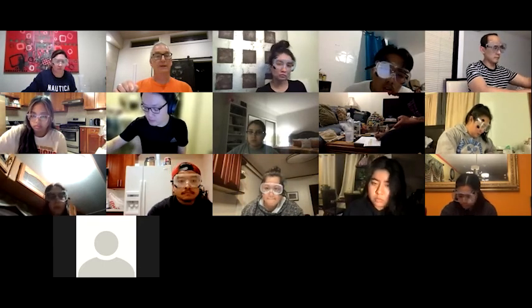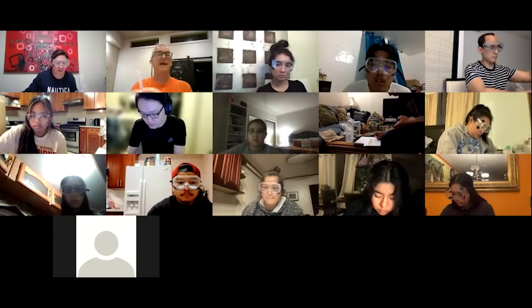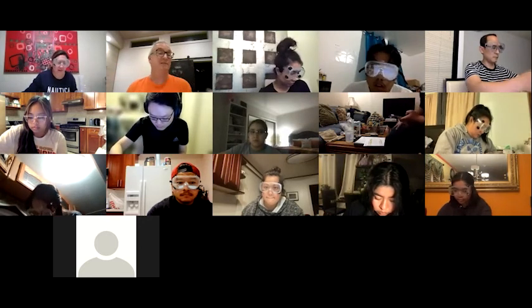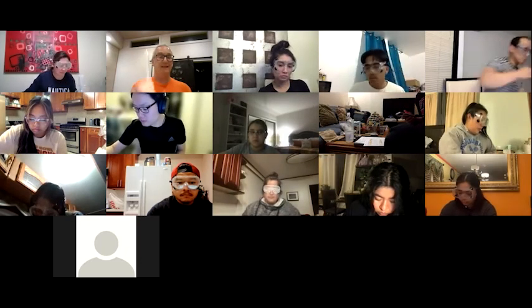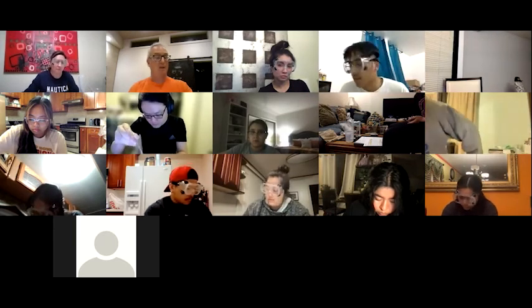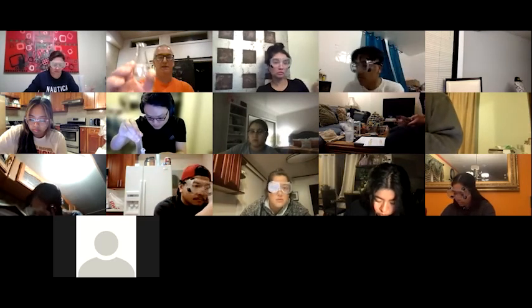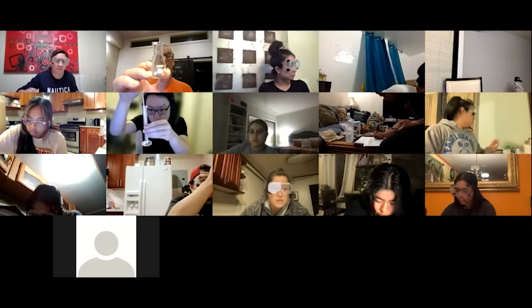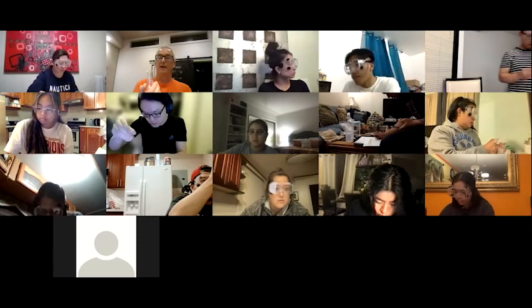Dispose. Ooh, you're really close. I mean, dispense. Yeah. It actually means deliver, but yeah, exactly. It means to deliver or dispense, because this does two things, right? It not only contains something, we also needed to dispense it too. Whereas with this, we don't use it to deliver anything. We don't use this for measurement at all. So you won't see that written on there.